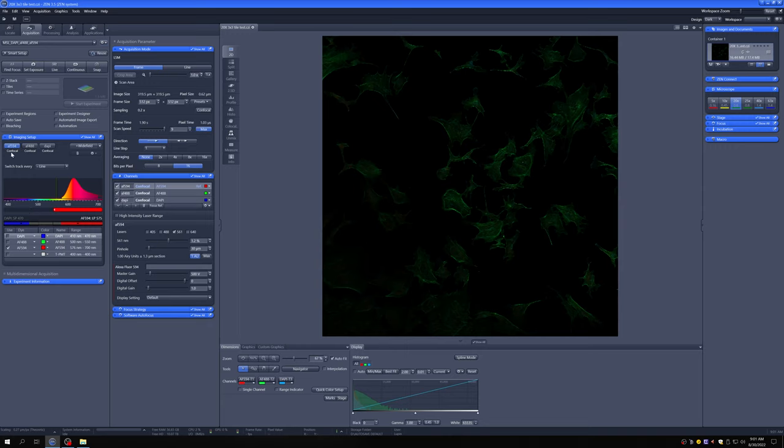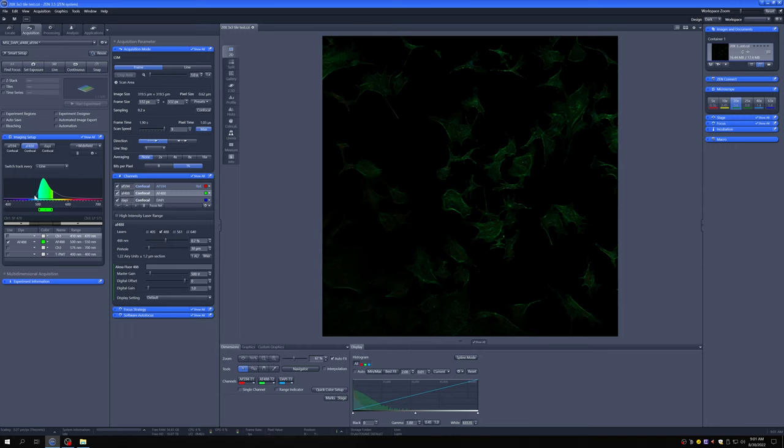We are taking three channels. We are first exciting the sample with the 561 laser and collecting the light that is longer in wavelength than 575. That is going to one of the three detectors on this system. We are then exciting the sample with a 488 nanometer laser, which is a good laser with which to excite Alexa Fluor 488, and collecting the light from 500 to 550 nanometers and sending it to another of the three detectors on this system.